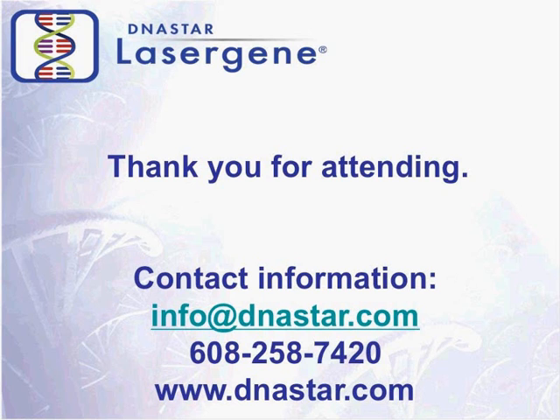All right. Joshua, let me just bring you back in. Ian went through this wonderful list of do's and don'ts and problems and so on. What do you find to be your chief bottleneck during the process of your assembly work? What's the biggest headache? Well, the assembly itself was fairly easy. I think the biggest bottleneck we've run into is trying to piece apart the relevance of different contigs. In other words, finding a contig with respect to SNP design, ensuring that we're within an exon so that we're not going to inadvertently jump an intron boundary when we're trying to genotype. That is certainly a bottleneck.